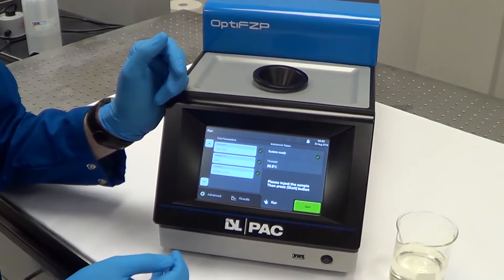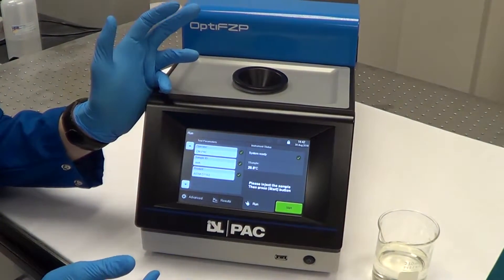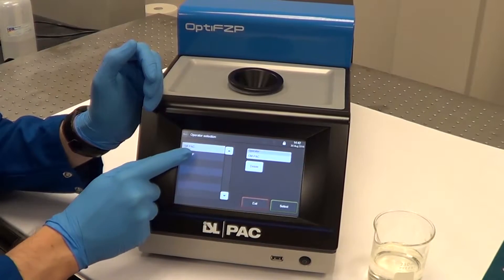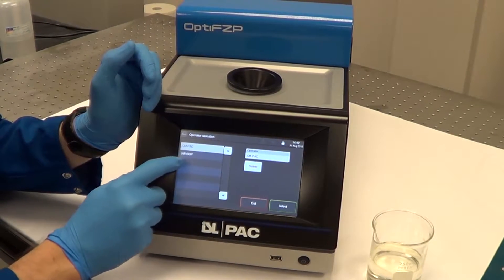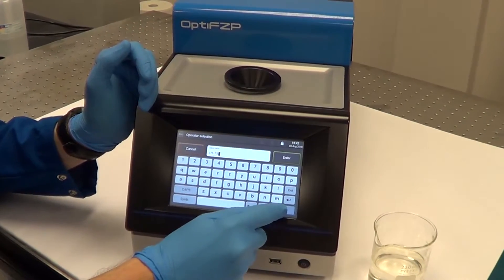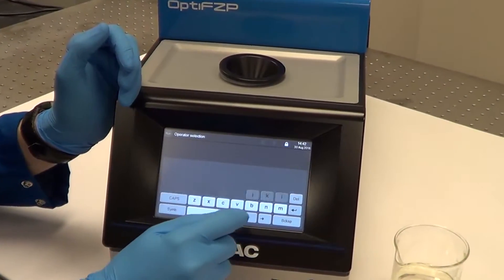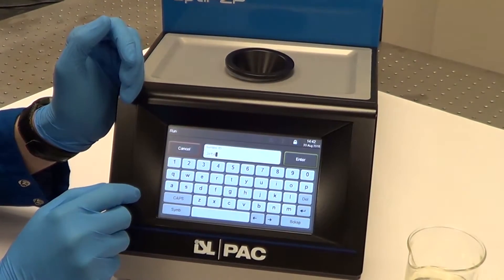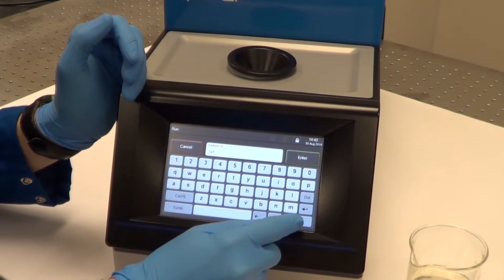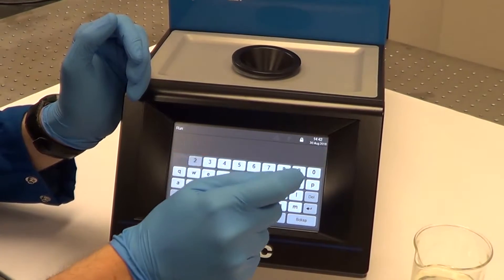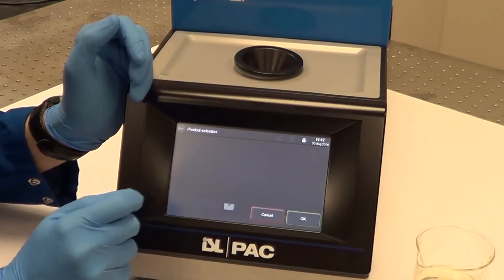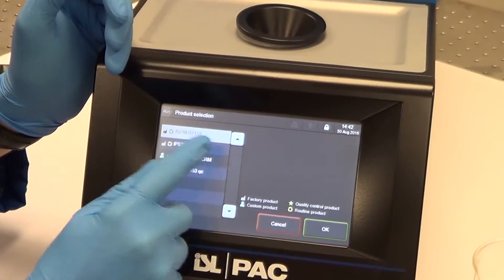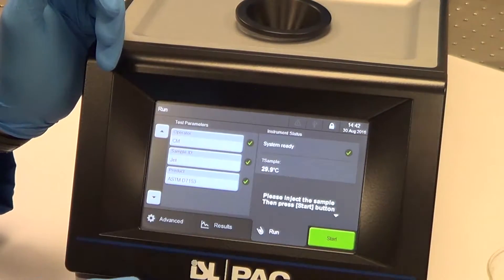After it's booted up, it comes to your main screen here, and you only need three things. You need your operator — you can select from the predetermined list here, or you can just type in a new name. Just select your sample ID — same thing here, we're just going to go with JET — and your products. In this case, we're just going to run it per the ASTM method D7153.